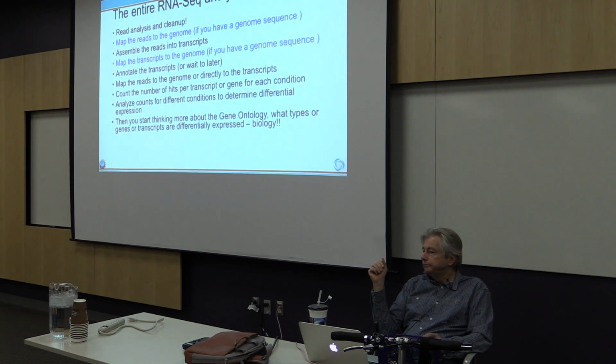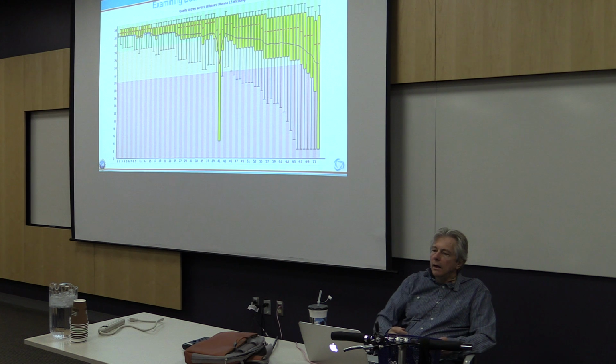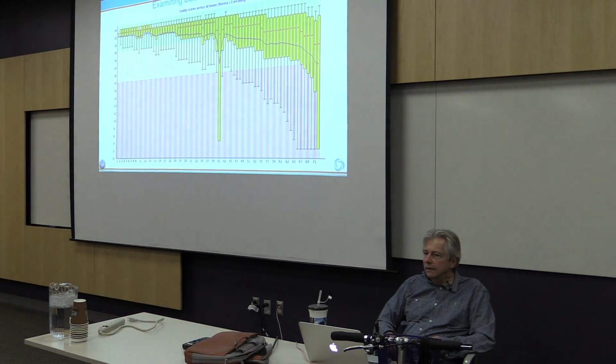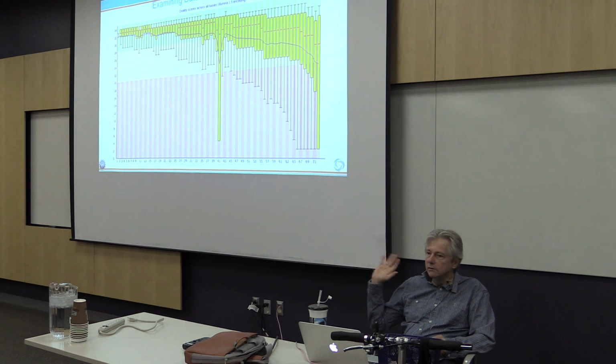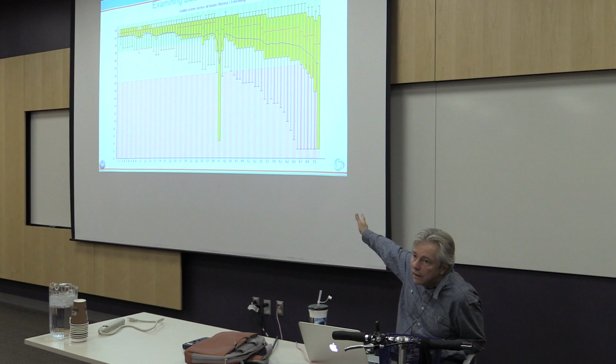And that was an interesting finding for me. This is the kind of information that eventually you can work towards. But today we're working more with the nuts and bolts. And the first nut and bolt process here is just an example of read cleanup. As I said, we're not doing that today, but it's important to note that you can analyze your data.